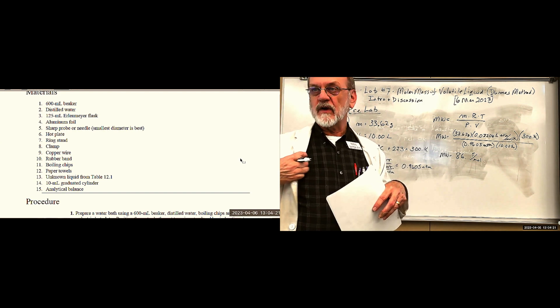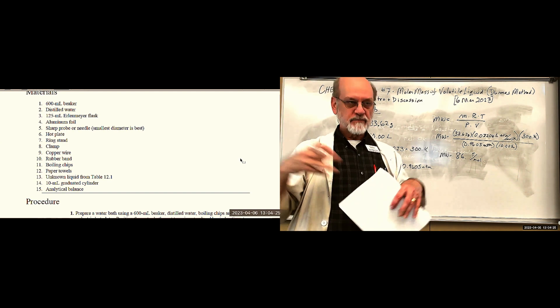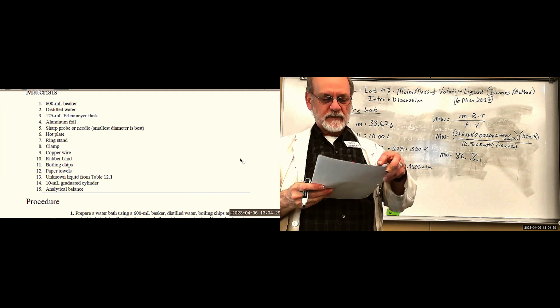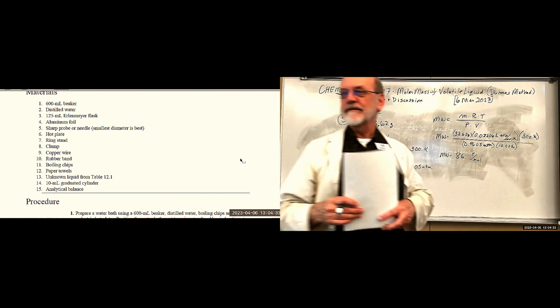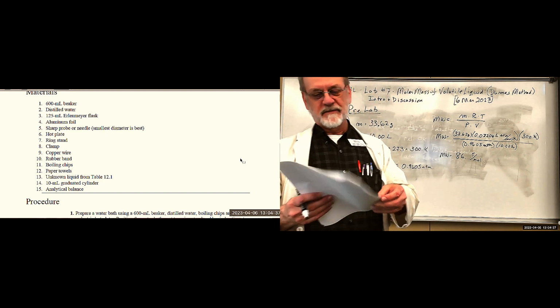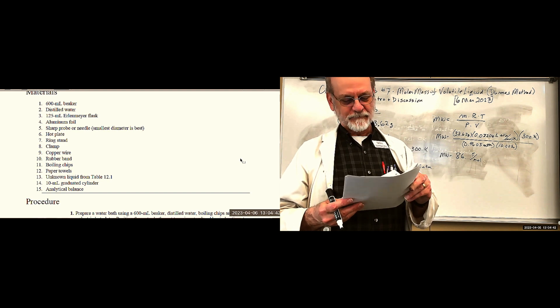I don't put the names on them when you pick them off the cart. You just pick the one you want and note the number. And some of them have a distinctive odor. So you could sniff them and say, I think that's this one. But you need to do the molar mass to prove it.